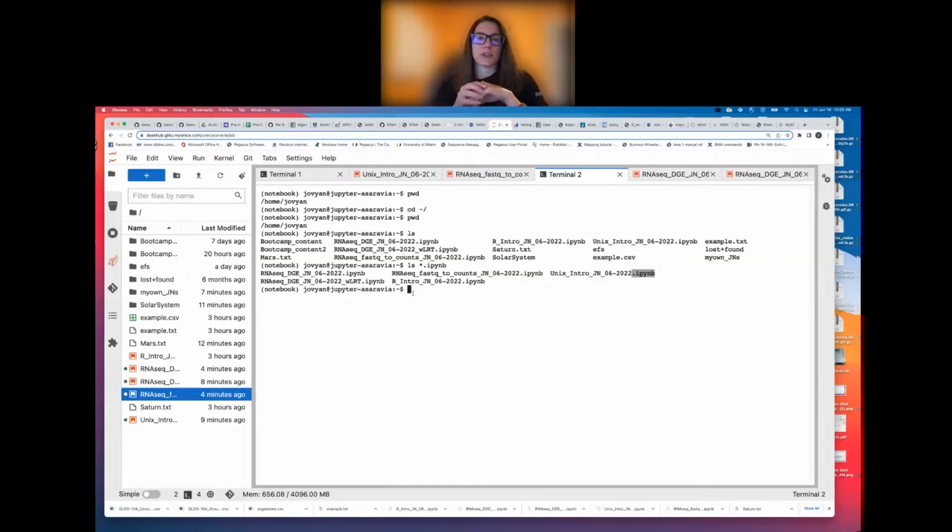Do you guys remember the command to copy files? Yeah, cp. Right. That's right, Ty. So we want to copy these files, but we just want to copy the files that end in .ipynb. So we can copy and paste this syntax. It's going to be cp star .ipynb, a space, and then the location to copy these to.